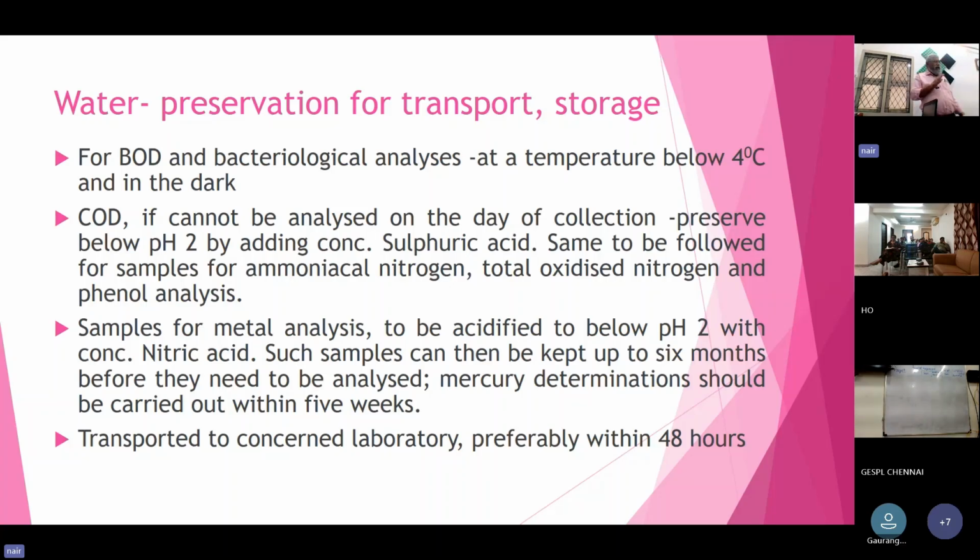So it should be analyzed within 1 month or 5 weeks. Then it should be transported to the concerned laboratory, preferably within 48 hours. So within 2 days, it should reach the laboratory.